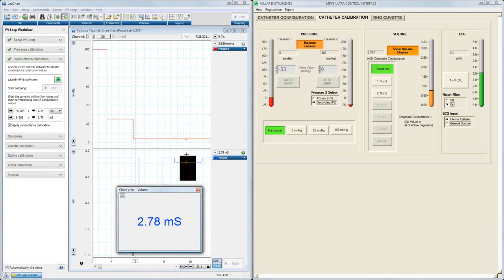Like I said, you can use microliters if you want to. Just keep in mind that is not a firm value. We would need to change that. It's not the final volume calibration. You're going to have to apply some corrections to that.